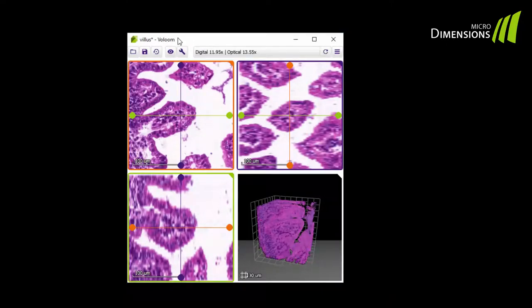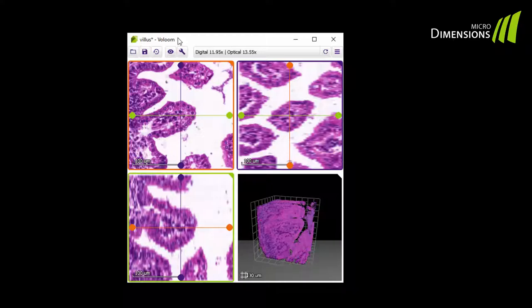I have loaded an already reconstructed dataset in Voloom. What you see here is the colon of a mouse embryo where I have zoomed in on the villus. Now let's see how you can segment that villus out of the volume.